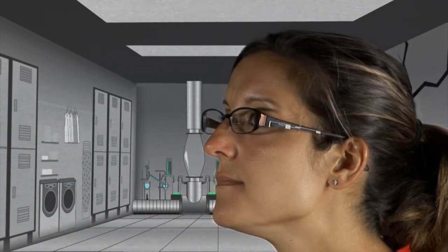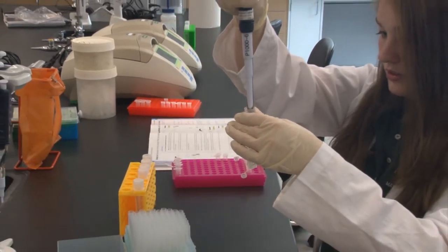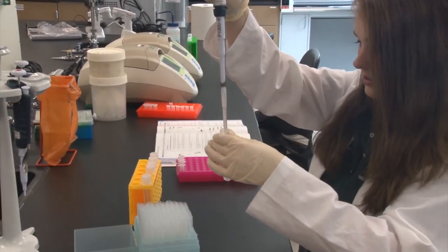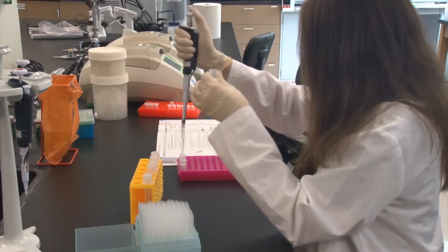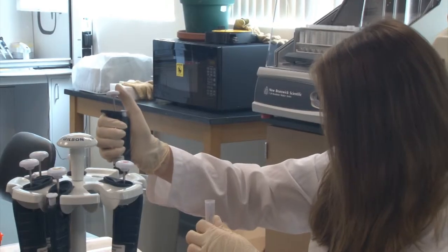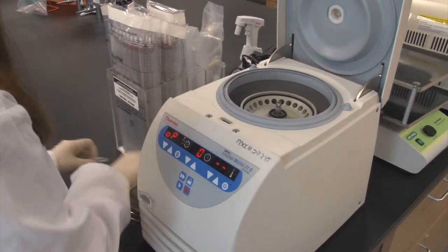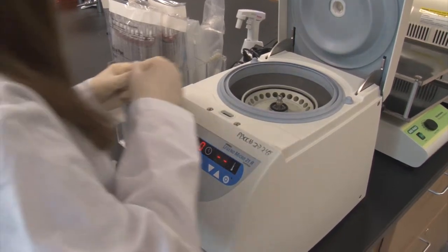Take one milliliter of the suspect's cheek swab solution. Centrifuge the tubes at 2000 G for five minutes to pellet the cheek cells.